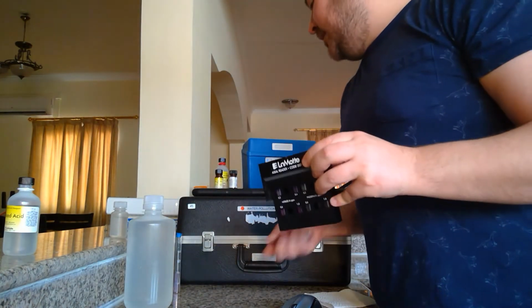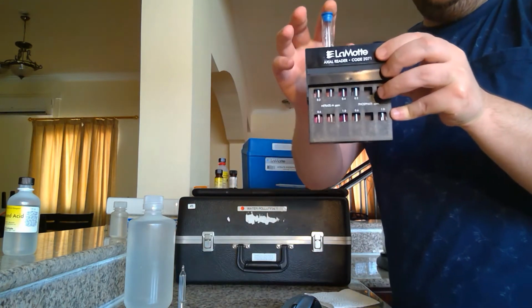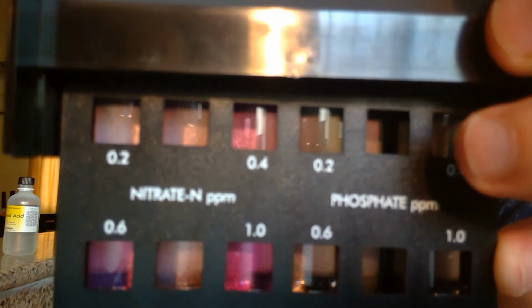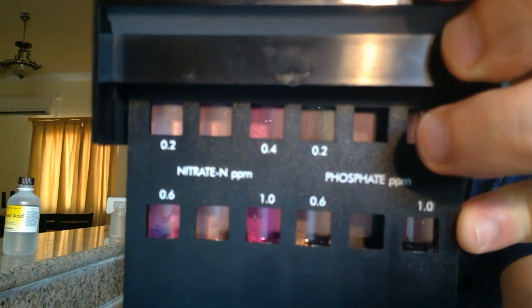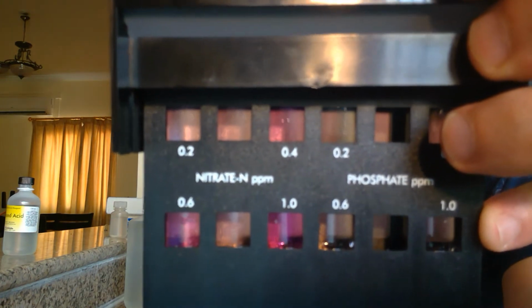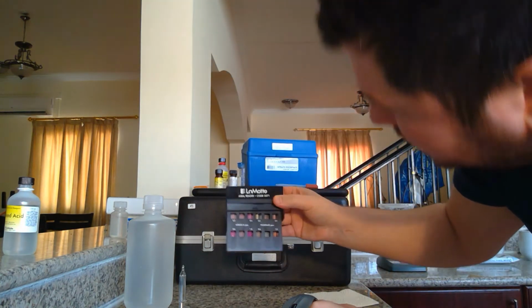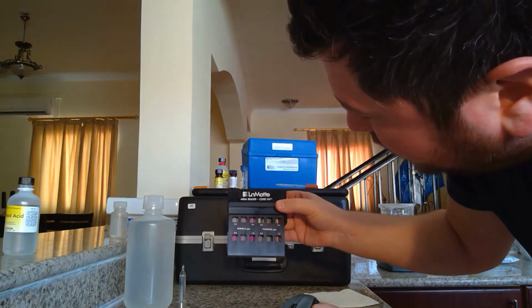So when I do the same thing with my sample from the Corniche, again, I don't know if you guys can see that, but it definitely resembles one of these colors. And it's certainly not as dark as the 0.4 or the 0.6 or the 1. It's closer to 0.2. And if I hold this up to the light and look at it, yeah, it's very much close to 0.2.